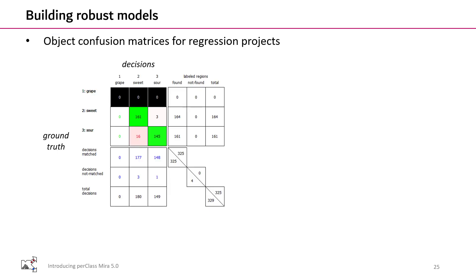Integrating with existing PerClass Mira tools, you can now estimate object confusion matrices for regression projects. This table summarizes decisions on more than 300 grapes. The sweet-sour ground truth is in rows and the decisions are in columns. This tool gives us full understanding and control of the desired performance trade-off for our quality inspection or grading system.